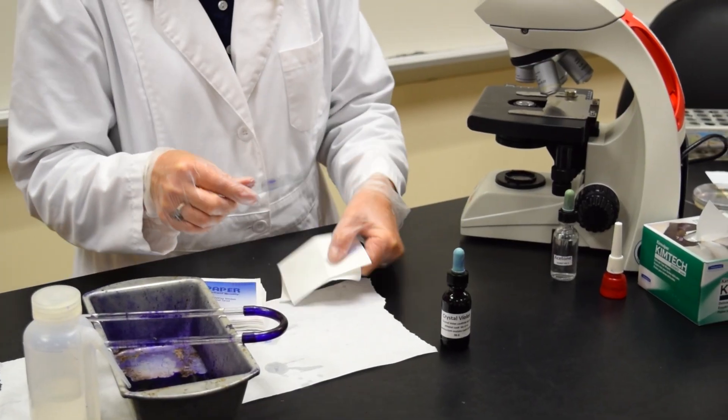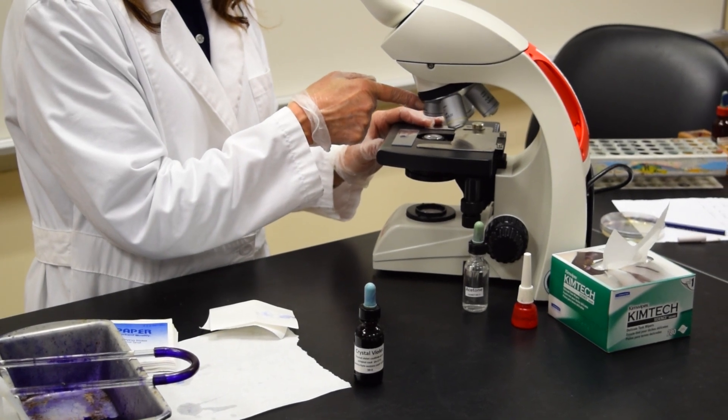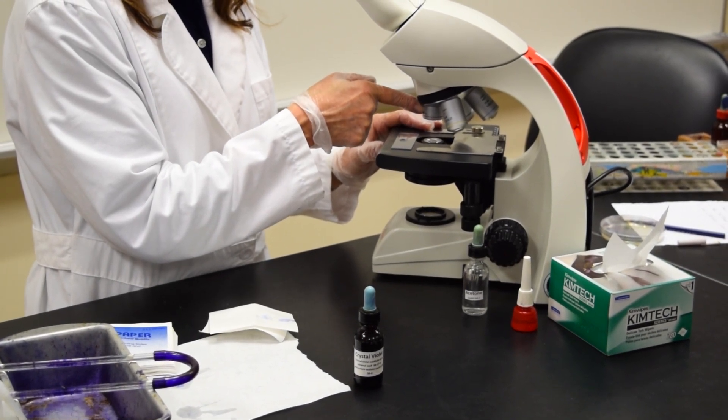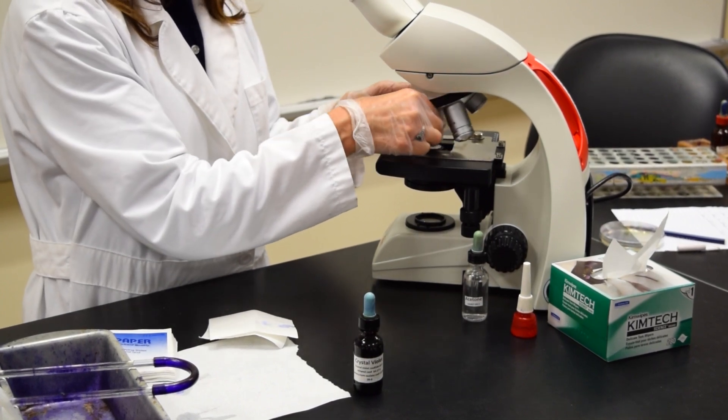Remember, when you focus a stained slide, you always start with scan. To get it in focus, use your coarse adjustment knob. Then move to low, then high.